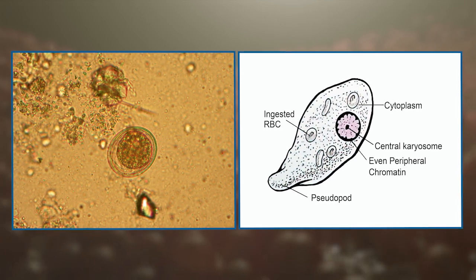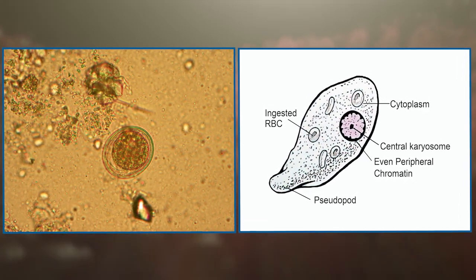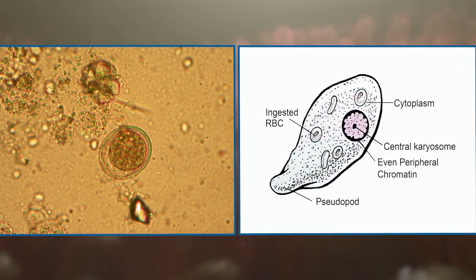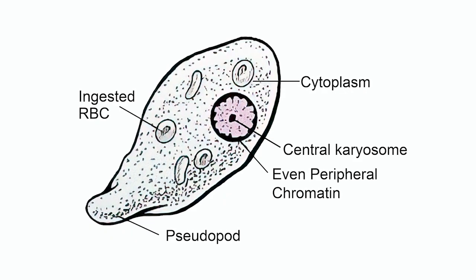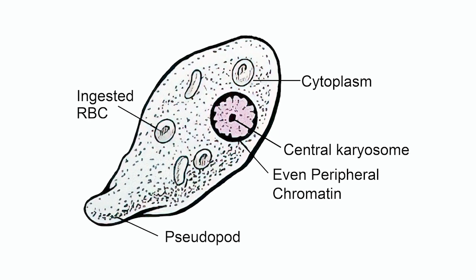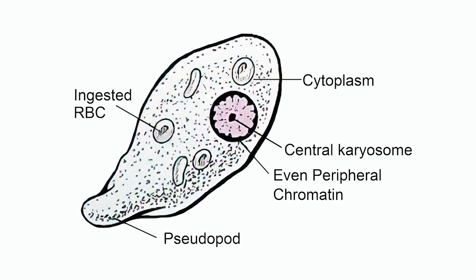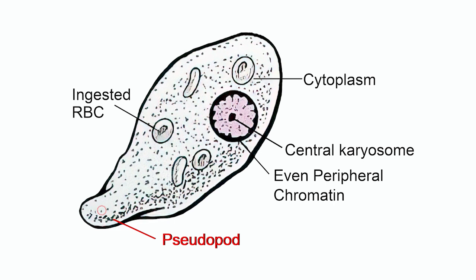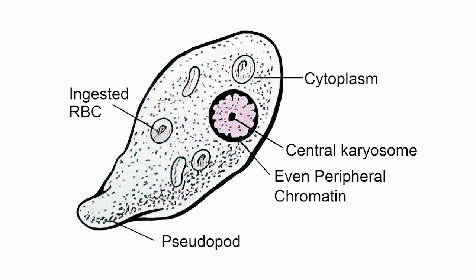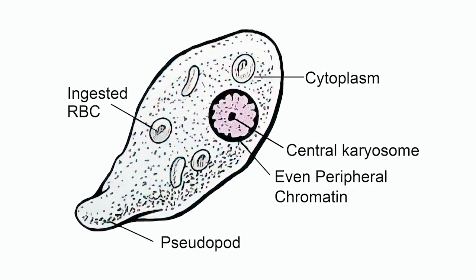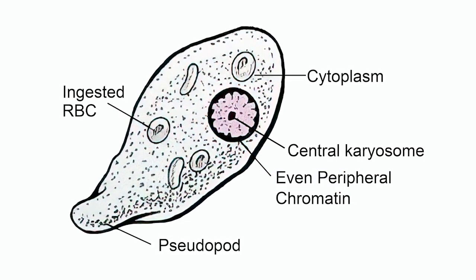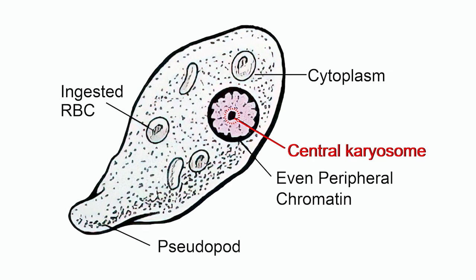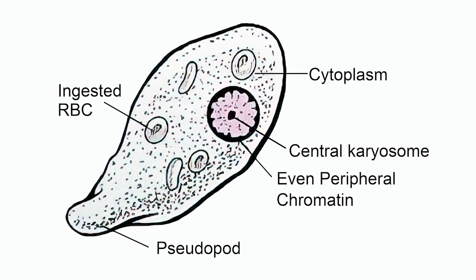What we have observed under the slide is that Entamoeba histolytica is a unicellular organism. It exists in the form of a feeding stage called trophozoite, or in the form of a cyst. The feeding stage is pathogenic. It is irregularly shaped due to the presence of pseudopodia. A single nucleus is present eccentrically in the cell. The nucleus has a peripheral ring of nucleoprotein and a central karyosome; the rest of the space in the nucleus looks empty.